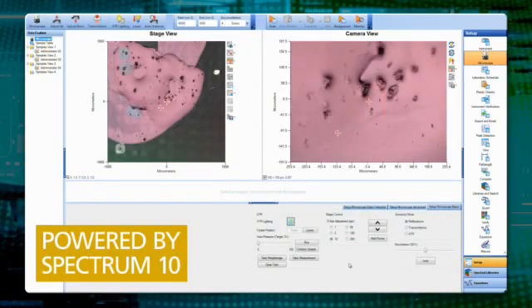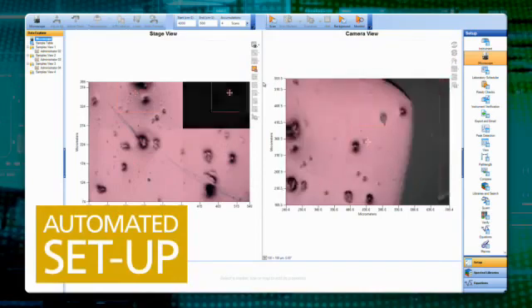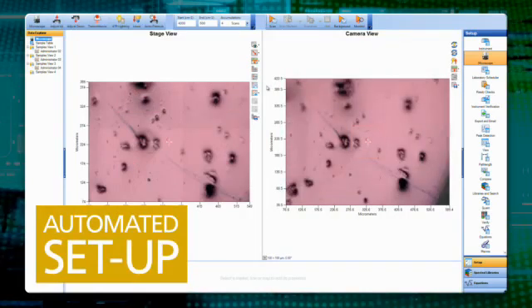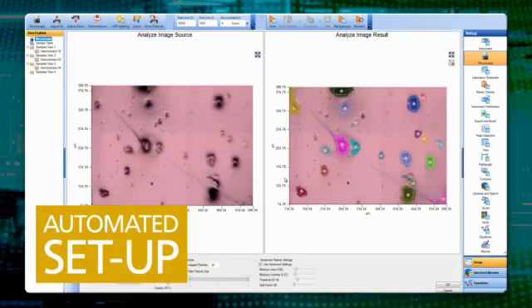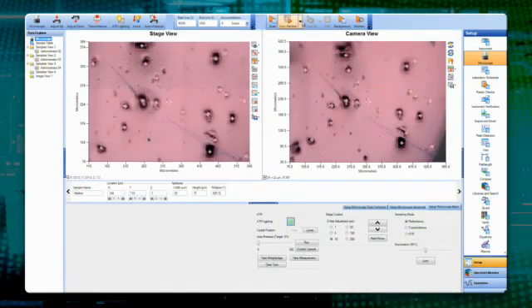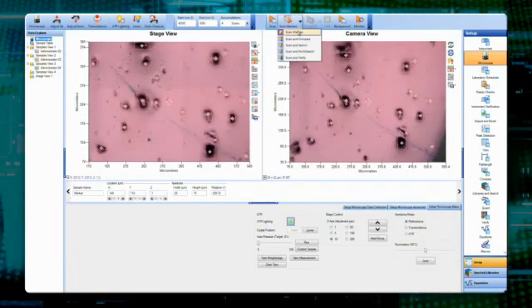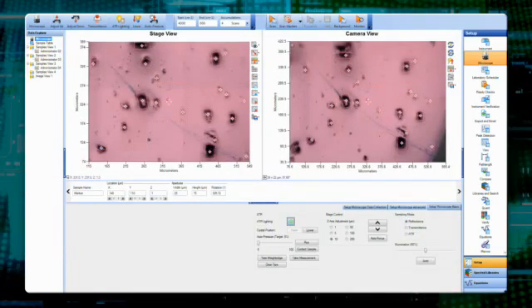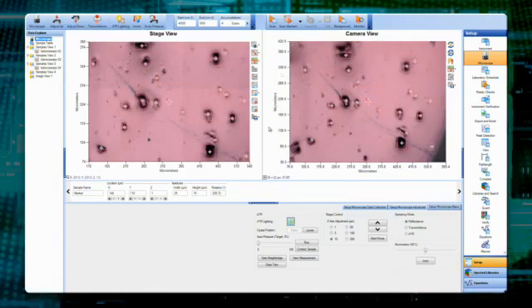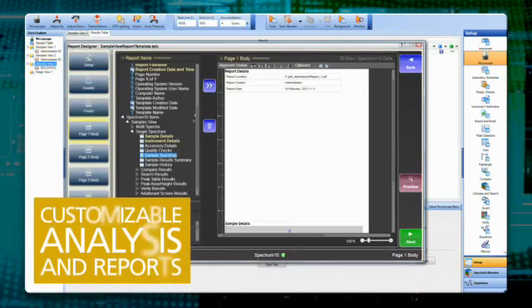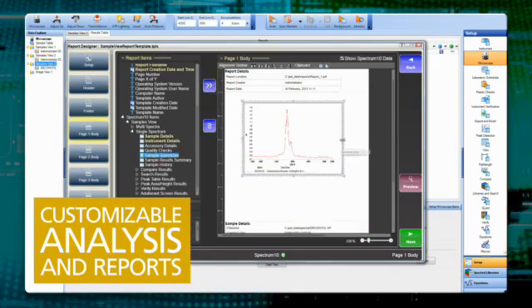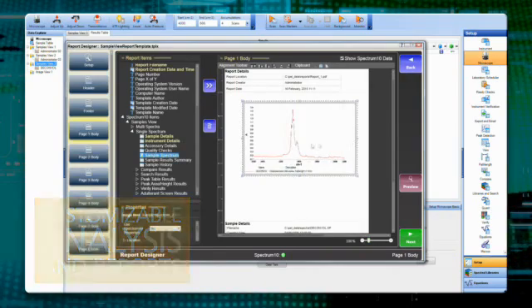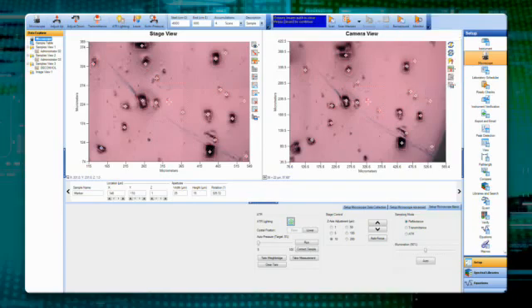By using automated microscope functions to locate regions of interest, setup times are reduced from minutes to seconds. Advanced spectral analyses are built into data collection for faster results and decisions, and reports and results can be visualized the way you need. The software interface is configurable to suit your needs and with local language support.